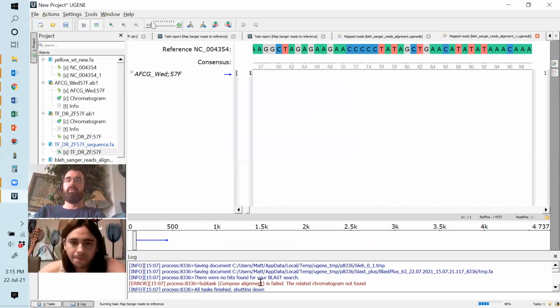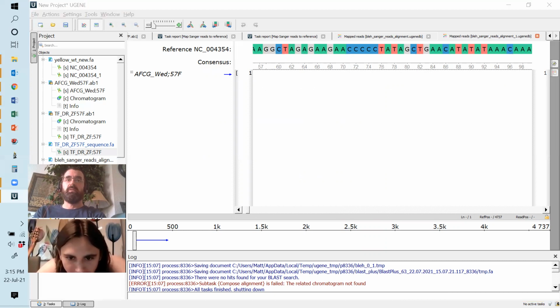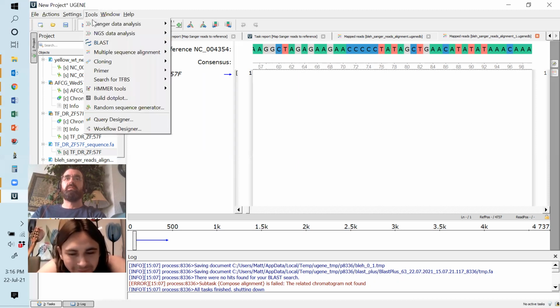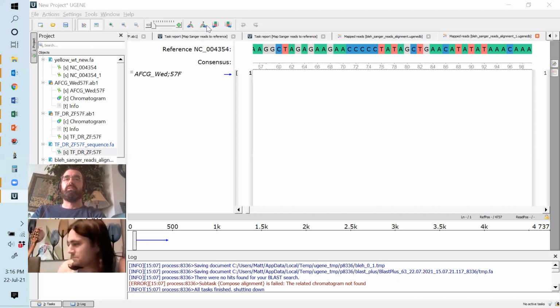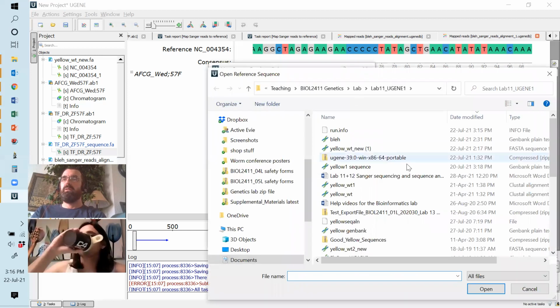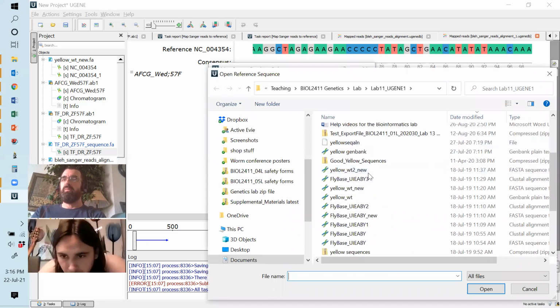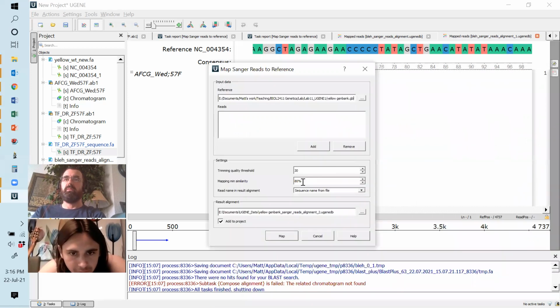Have you done that? Then click map, and that should, oh, you got to be kidding me. All right. Curse you, Eugene. All right, so it doesn't like that one. Where's one of the ones from GenBank? Pretty sure that's the GenBank one.